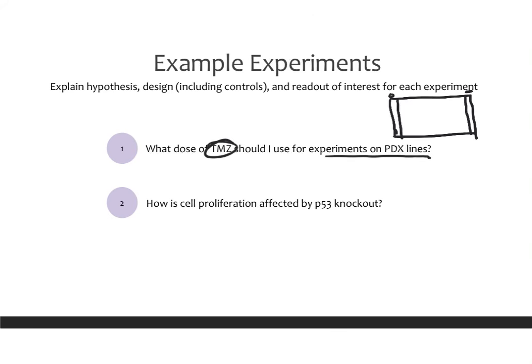And then here you might range from like 0.1 to 100 of TMZ. And then this would be your 8x replicates. And then perhaps you'd have a plate for every cell line you were interested in. So maybe you could do 43s and 6s and 5s and U251s. Those might be cells that you're interested in looking at. And then you would analyze this and you would be able to generate an IC50 for every line. And that IC50 would tell you how sensitive every line is to TMZ.